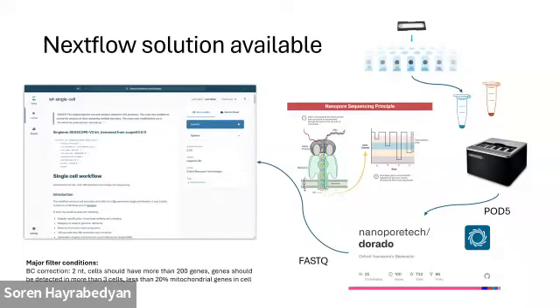And this data set was basecalled with Dorado version 1 from this year with the super accuracy model. What this means is that the raw data is processed by a tensor-like artificial intelligence algorithm that detects the current through the pores, and from the current, it identifies the base. What is good is that it's actually very appreciable.